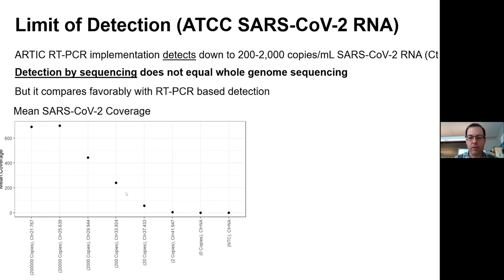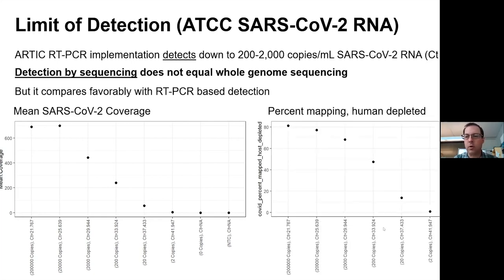The reason for this curve is that as you go to more dilute samples, more of your library is mapping to something else or not mapping at all. What we're measuring here is that at reasonable CT values, most of the library's reads belong to the SARS genome and are amplified properly, the remainder being adapter dimers, contamination or other odd products. Then as you go to a more dilute sample, it just becomes more difficult to generate a library with consistently high amounts of viral RNA inserts.